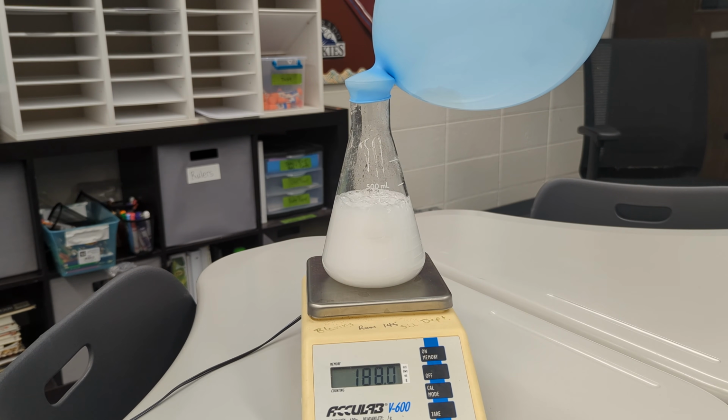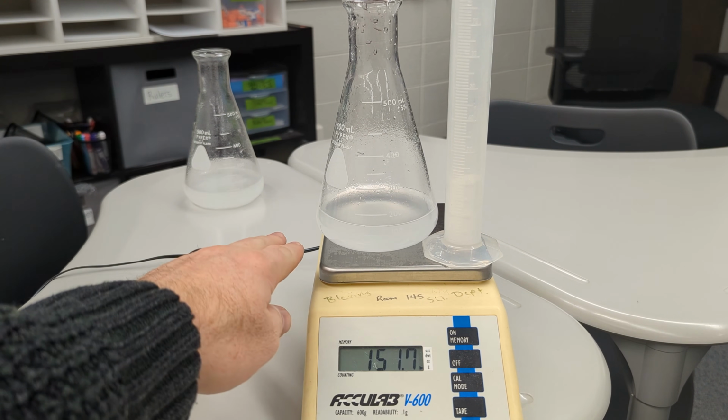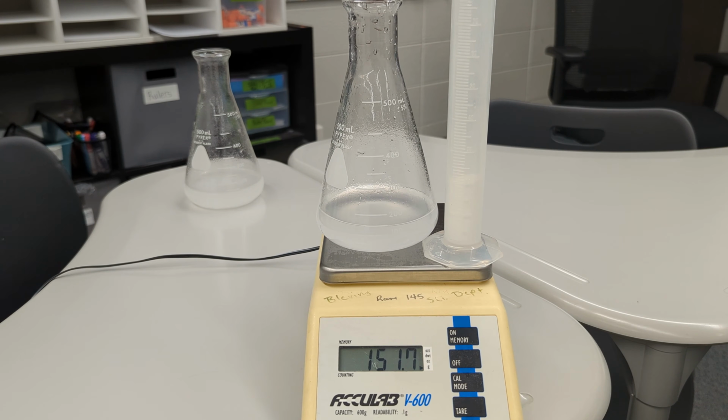conserve that mass. So here we're looking at the exact same chemical reaction, but without a closed system since there's no balloon on top of the Erlenmeyer flask. I still have a citric acid solution in the Erlenmeyer flask, and I still have the same volume of baking soda that was in the balloon. But we're going to react these without the balloon, and we'll see what happens with the mass, since a lot of this mass is again being converted to gas, but now there's nothing to keep the gas in the beaker.